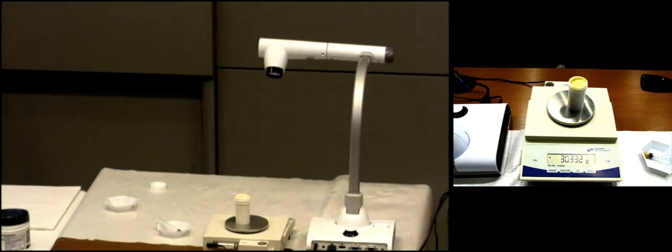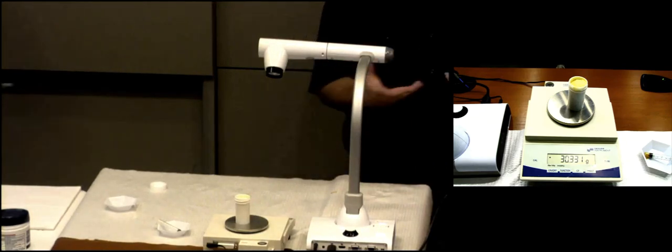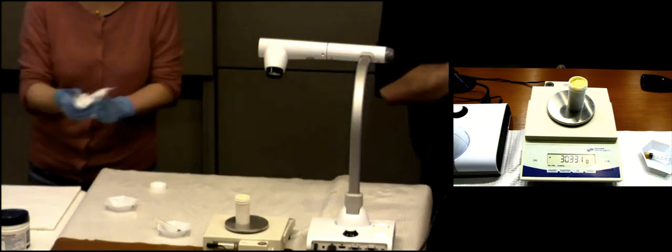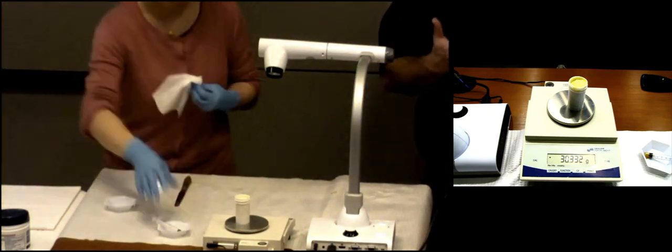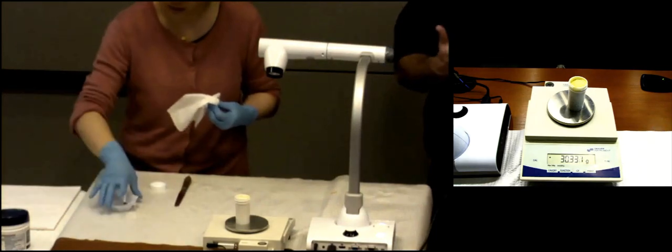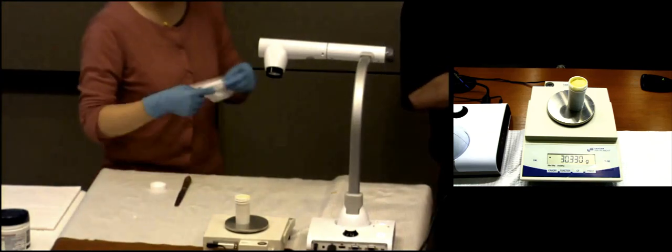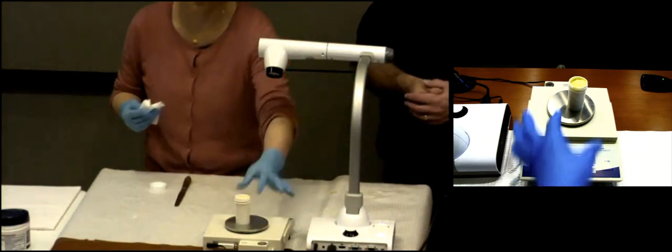So don't write that down, though, for your QA, because here's the deal. What haven't we done yet? We're almost done, but she hasn't finished dressing it yet. And in the dressing process, there might be a little bit of loss. You really do want to weigh it before you dress, because if she was already at 28.5, what would you want to do when you dress it? Almost don't dress it. Make sure you don't lose anything. Does that make sense? But she's got plenty of excess here that a little bit of loss as she's dressing isn't going to be a problem.